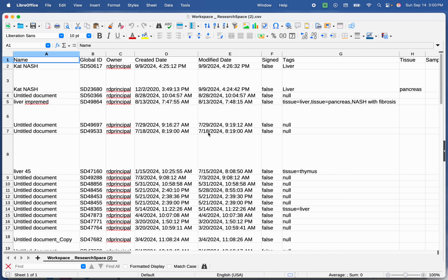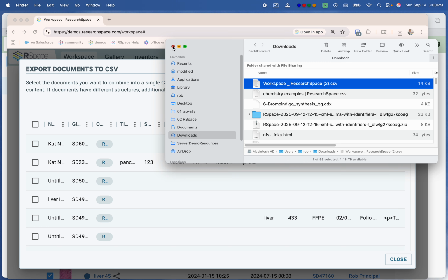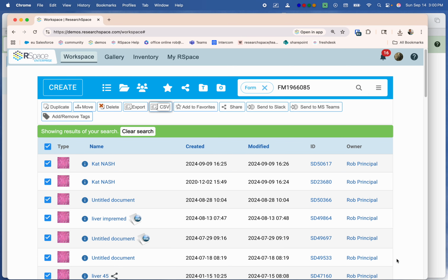I can plot one variable relative to another. And this is something that chemists do a lot. So this would allow you to build a cohort of experiments that you can then examine further to understand the progression of one variable relative to another, or the progression of a particular variable over time across a sequence of experiments.